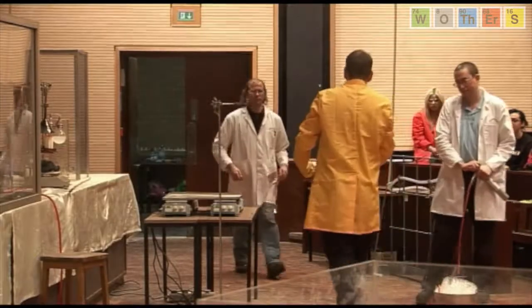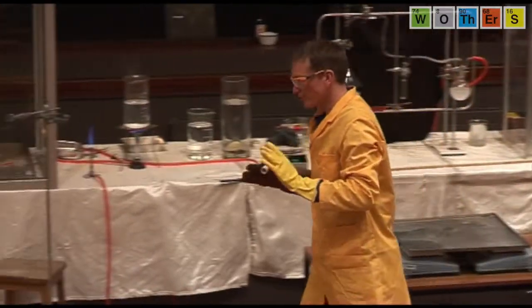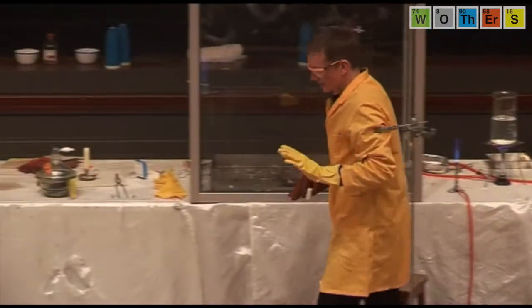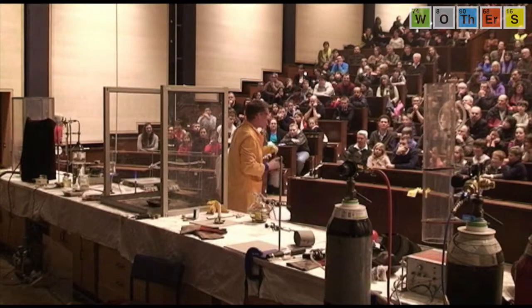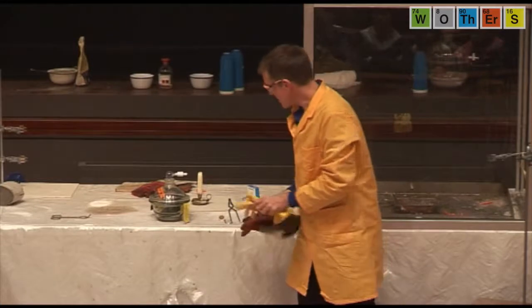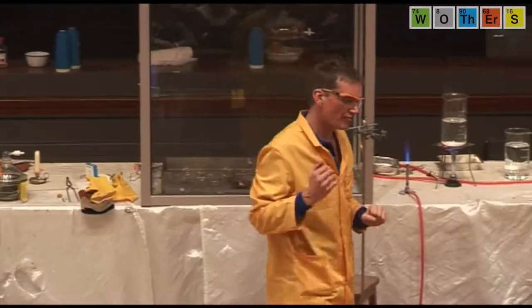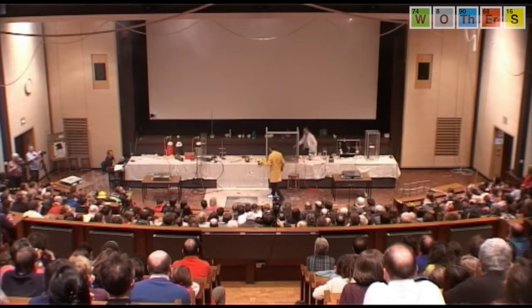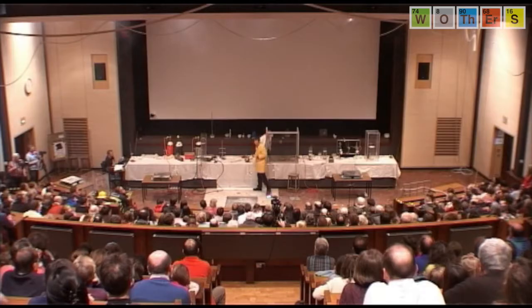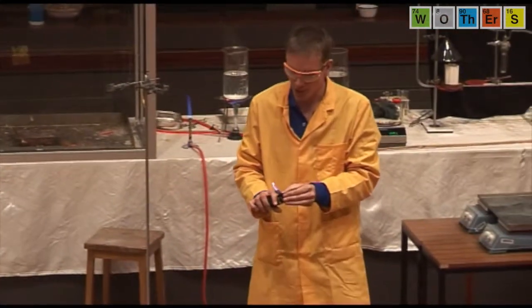Okay, so there we are. The red color that you saw there was from the lithium that was present. And the substance reacts with any moisture in the air to form methane. Methane is another hydrocarbon, contains 1 atom of carbon, 4 atoms of hydrogen, and it is flammable. Methane is the gas that we'd normally use most of the time for our cooking. It's the gas that's present in normal natural gas.